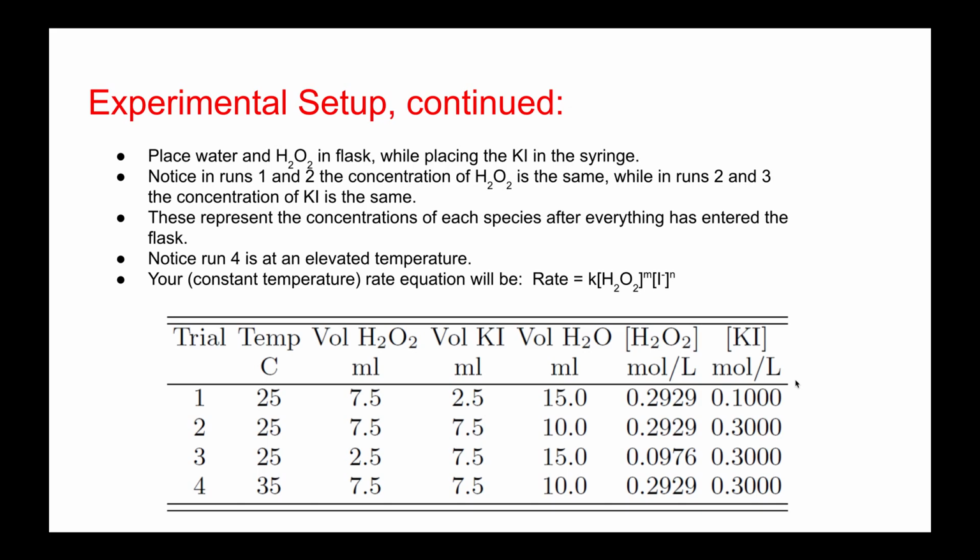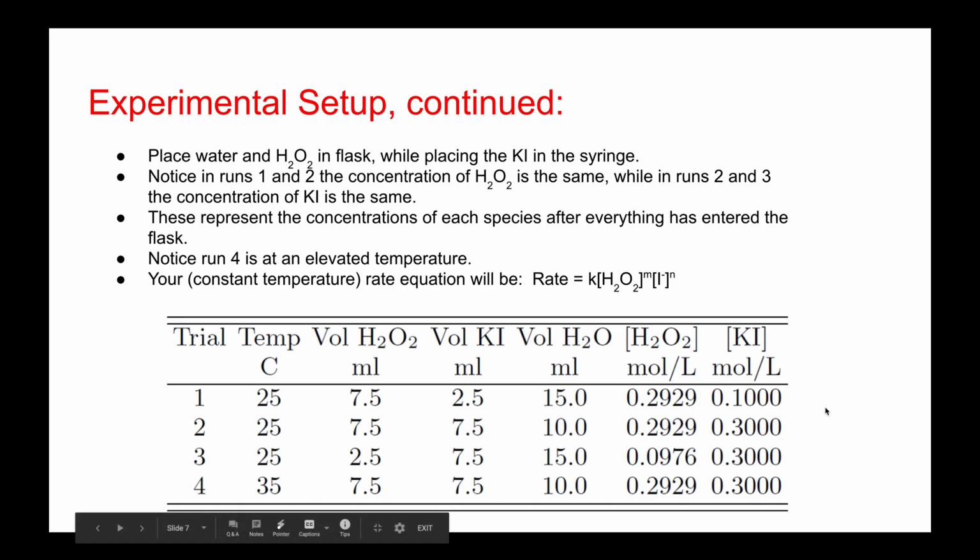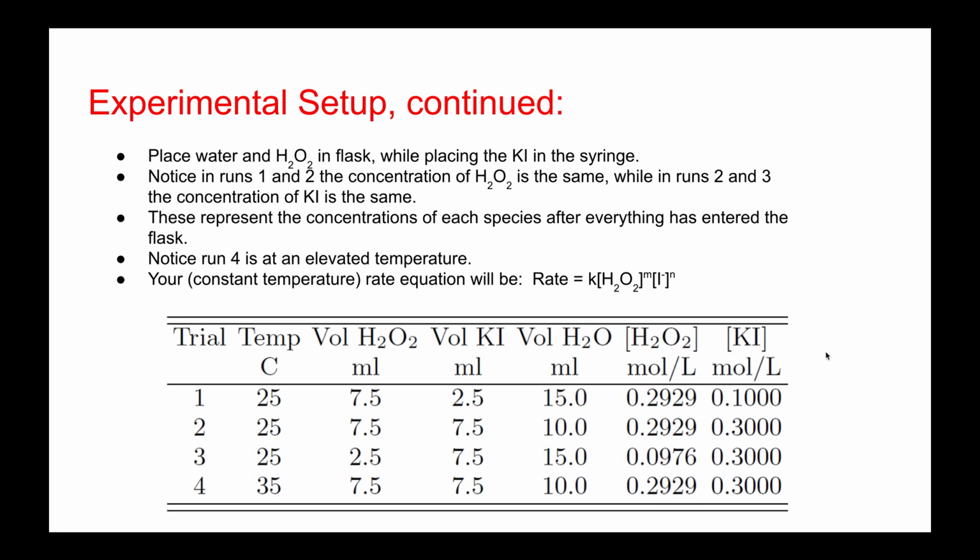You do runs 1, 2, and 3 at the same temperature. Again, then you elevate run 4. I'm going to mention this again, but if you're ever doing this, here we're using 30% H2O2. It's fairly corrosive. It could blind you, so you must wear goggles.